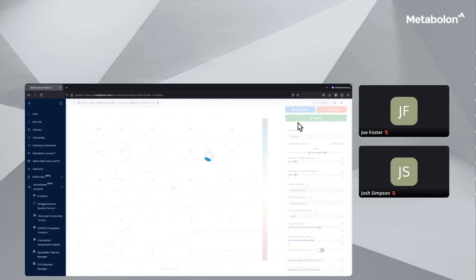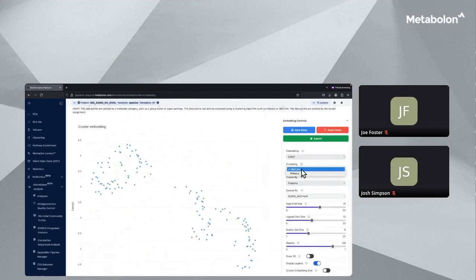Our final integrative clustering screen is the embedding screen, which provides a complementary view to what is visualized in the other metagenomic-metabolomic correlation clustering heat maps. While the integrative heat maps directly cluster this metagenomic and metabolomic data set based on similarity of correlation profiles, the embedding screen uses dimensionality reduction, such as PCA or UMAP, to project feature correlations into a lower dimensional space. Clustering algorithms are then applied to group similar data points.